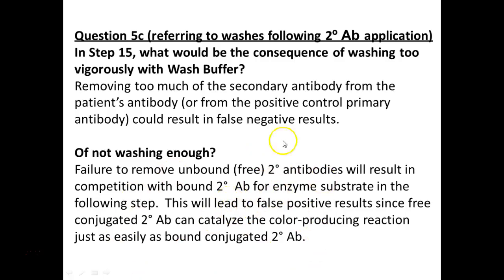And definitely for this one, if secondary is present, you're going to get a false positive. And for our negative controls, we've got to make sure we wash out. Although, again, it shouldn't get hung up, because it's just antigen in those wells, and we know the secondary is not supposed to bind to the antigen. It's supposed to bind to the first antibody. Still with me? All right.